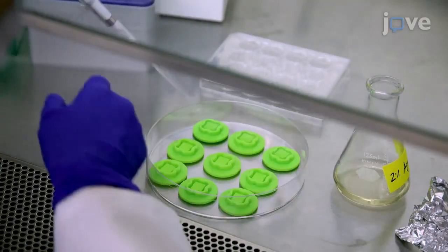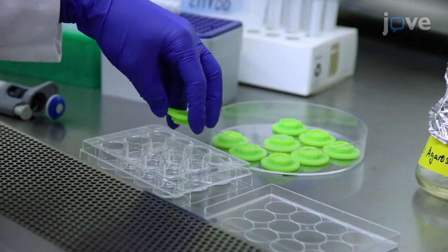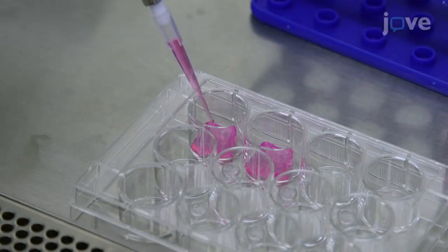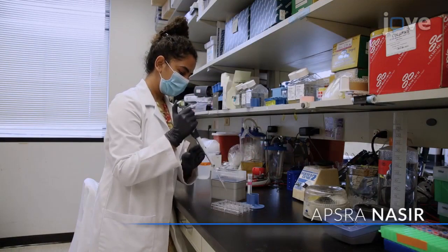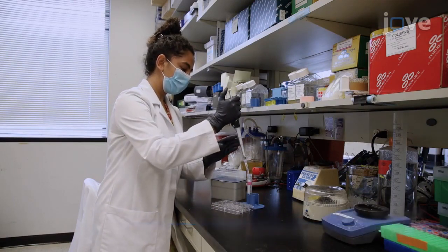These methods can provide mechanistic insights into immune cell-mediated tumor cell cytotoxicity and invasive behavior in a 3D setting. The main advantage of this technique is that this 3D spheroid co-culture model does not require the transfer of spheroids for multiple subsequent assays. Demonstrating this procedure will be Apsra Nasir, a PhD student from our department.